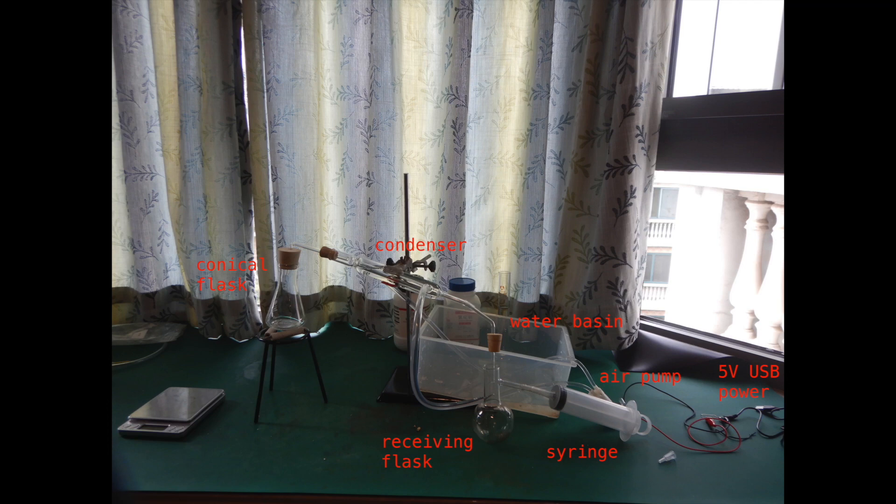First, we build our apparatus. Our apparatus consists of a 150 milliliters conical flask, a condenser, a receiving flask, an ice water bath, an air pump, a water basin, a power supply, several tubings, and a syringe.